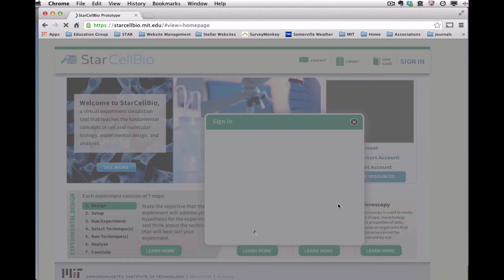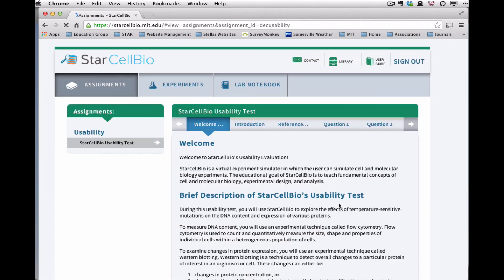When you are signed into your account in StarCellBio, the program will save your work between different work sessions. You are now signed in to your specific course within StarCellBio and you are ready to get started.